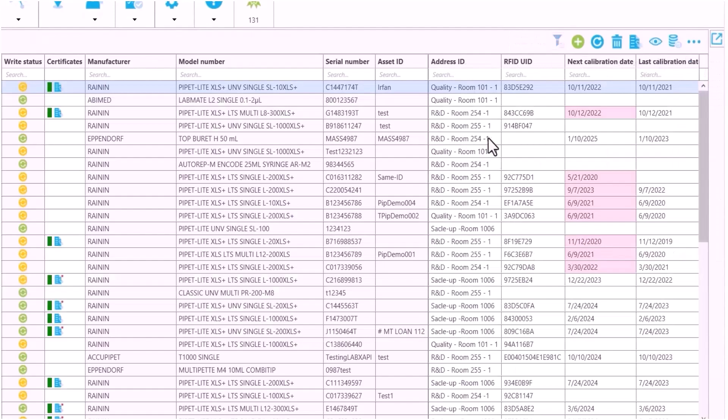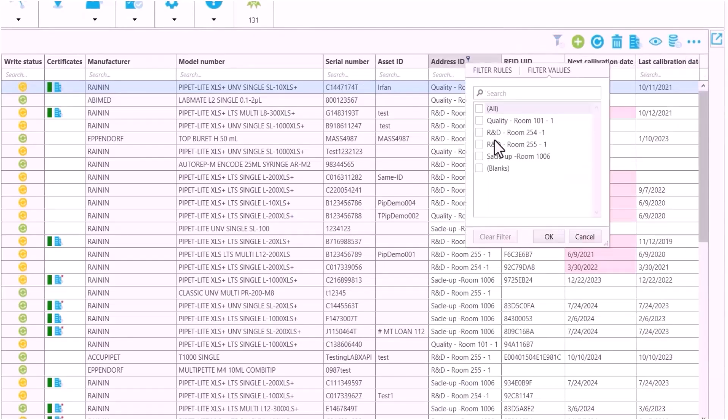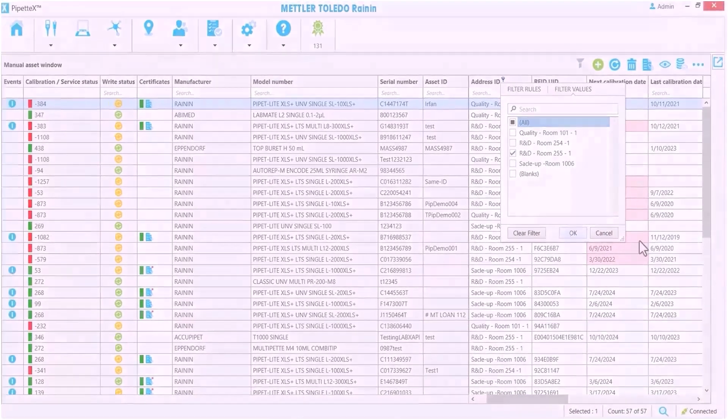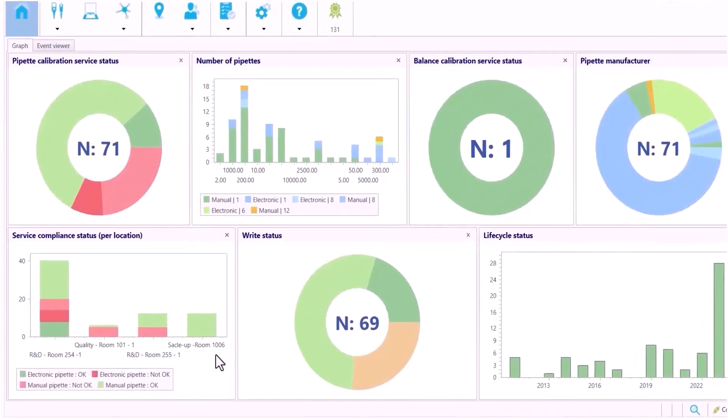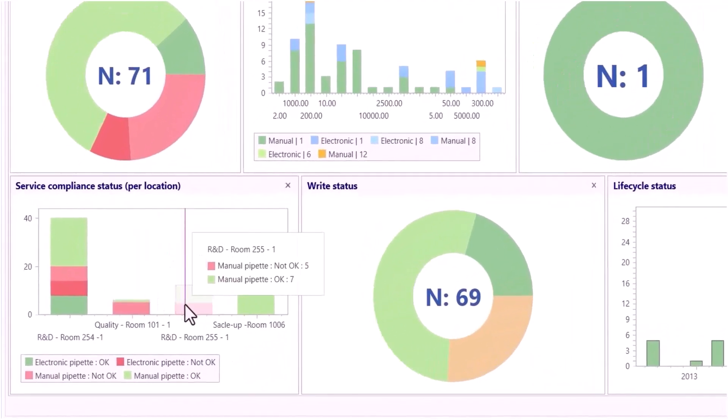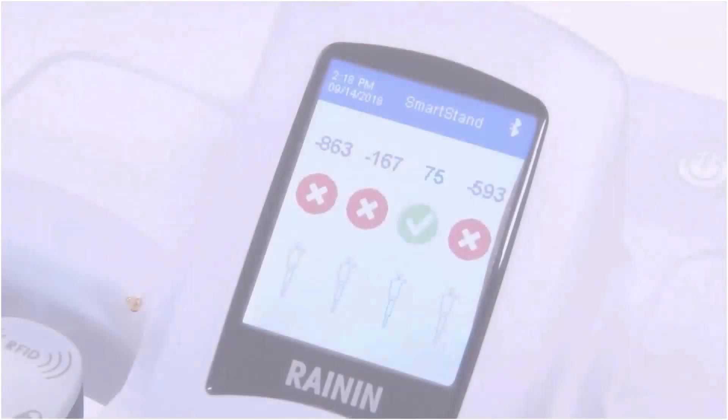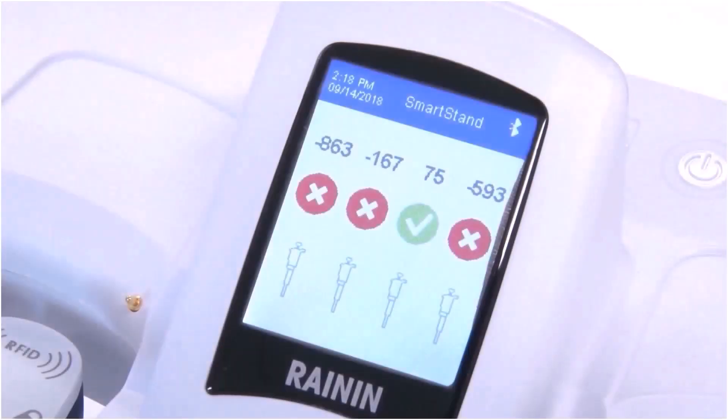For example, this chart at the bottom is split up by lab. It shows if pipettes in a lab are calibrated or not. Researchers at the bench see those same colors when a pipette is on a smart stand, so they know the status as well.